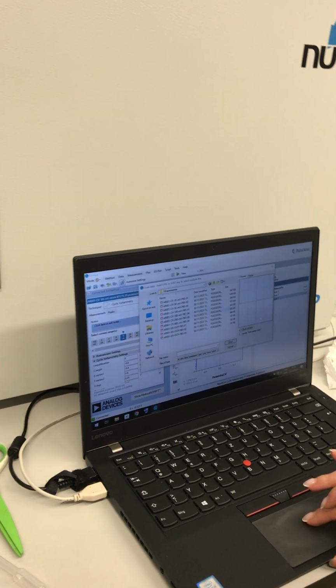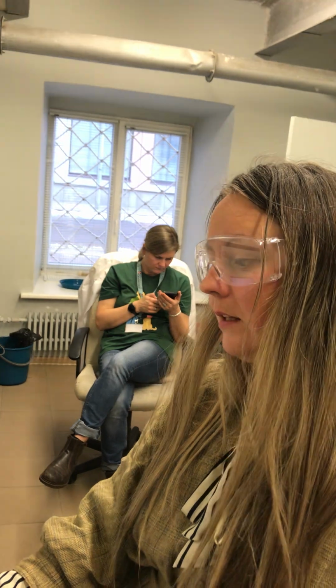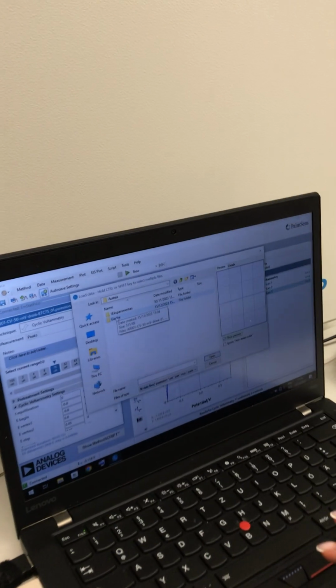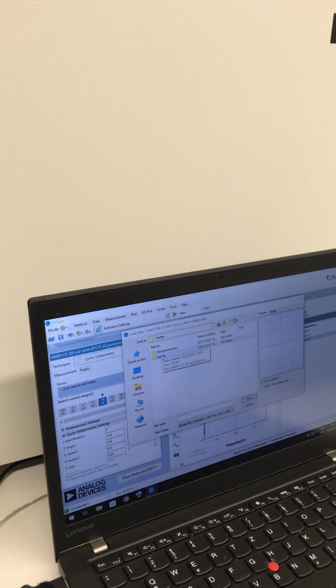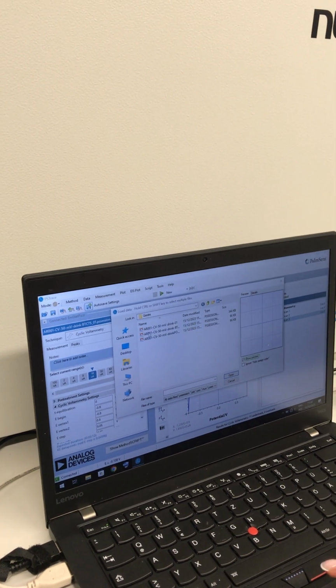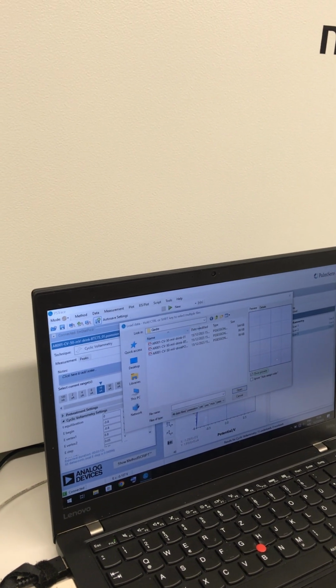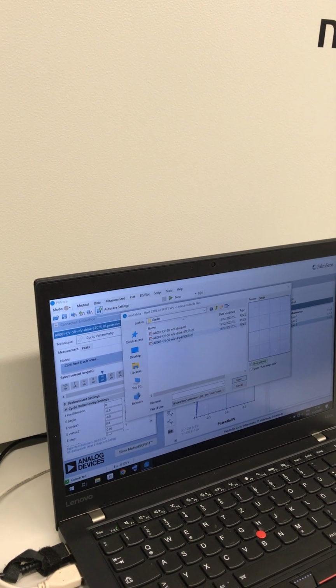And it's a widely used software for this electrochemical sensing technology? The software is not so widely used. There are plenty of different ones, but this is my favorite, and I think it's user friendly as well, and powerful. You can analyze data directly. If I have to choose between the softwares that we have present, there are almost 10 different companies, I would take this one. PalmSens. Yes, Netherlands.